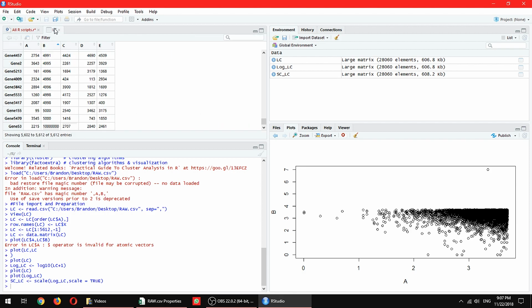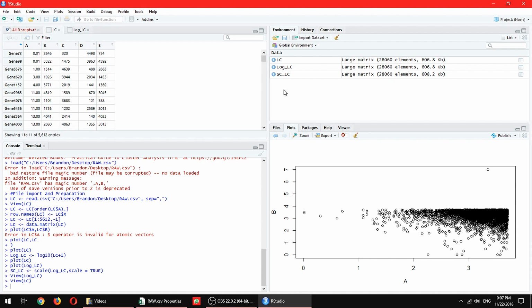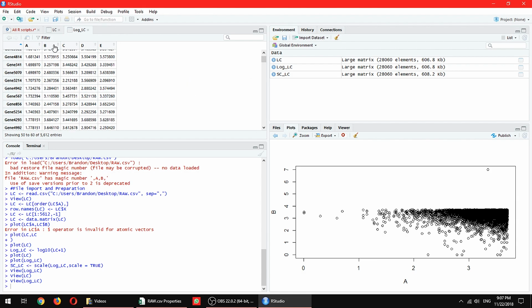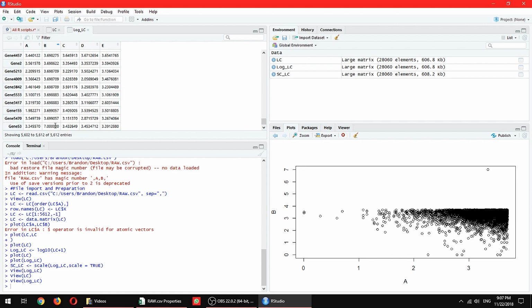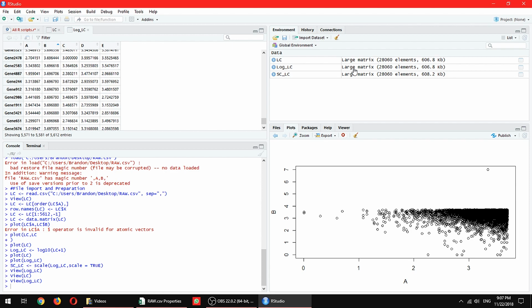Once we're done, you can see here, this is your raw data, which looks somewhat like that. They are all whole numbers. And once you log that, you would realize that everything is a lot smaller and a lot closer together. Even your biggest and smallest values just now, remember we have 10 million in sample B, it's now become a 7. So they are a lot closer together, a lot more visualized, and a lot easier to work with in general. So in this case, what we're going to do is run a scaling.